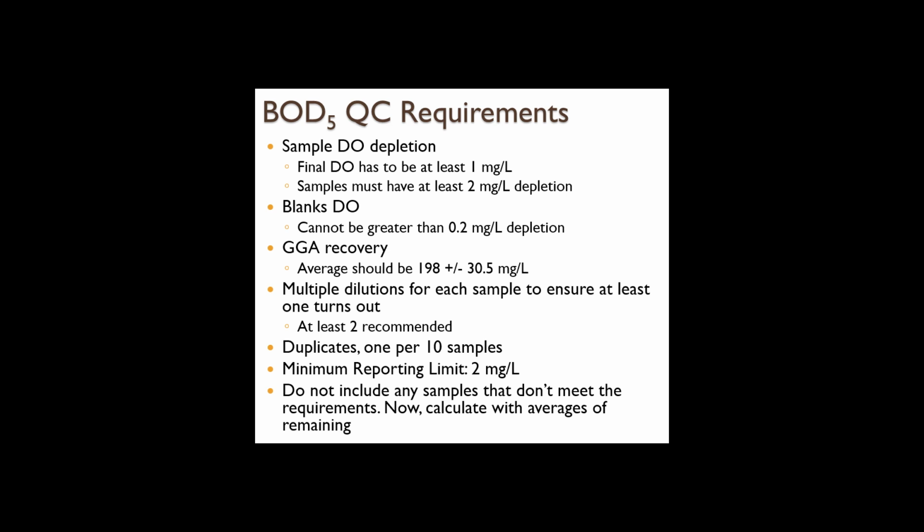Blank DO depletion may not be greater than 0.2 milligrams per liter. GGA recovery needs to be between 167.5 through 228.5 milligrams per liter. If multiple dilutions from the same sample pass the QC requirements, average the results to determine the final BOD values.